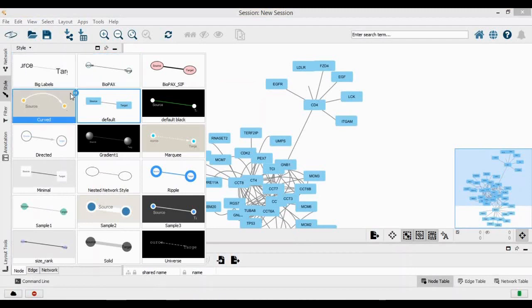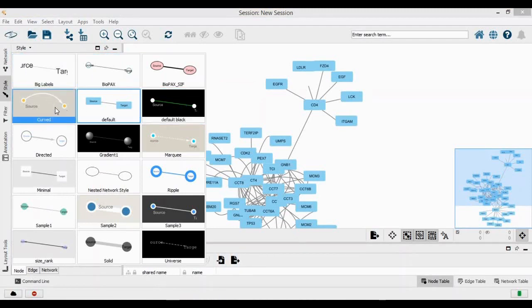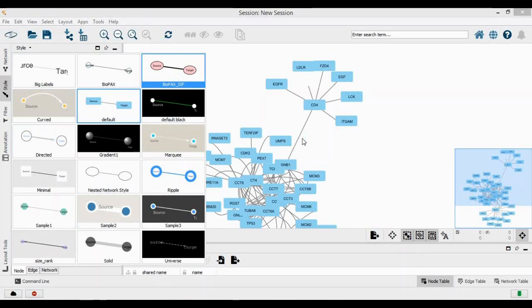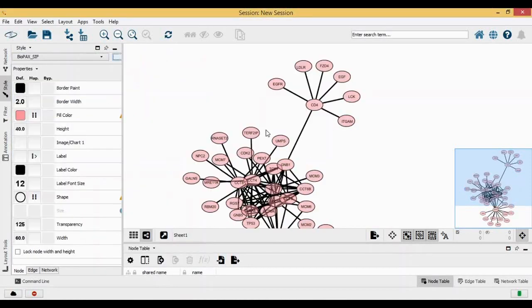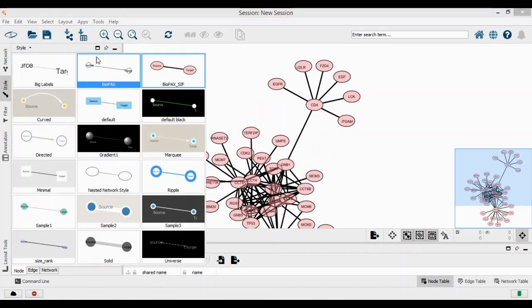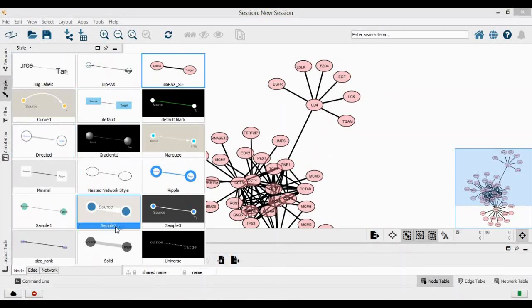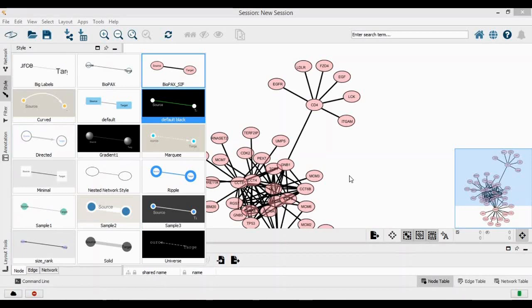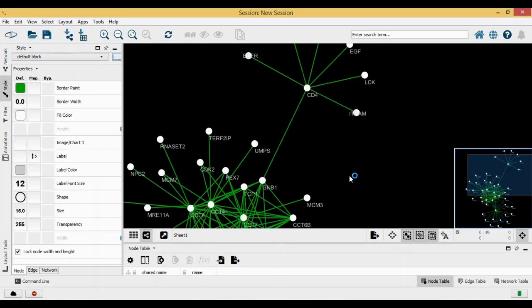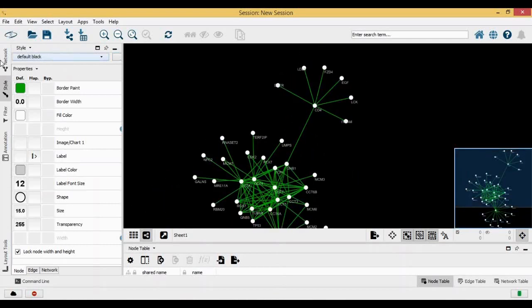If I click on this you will see a number of style options which will be given. You have big labels, biopacks, default, default black curve. Let me select biopacks sif. You can see the representation of the network being changed. If I want something else, let's go to the default black.